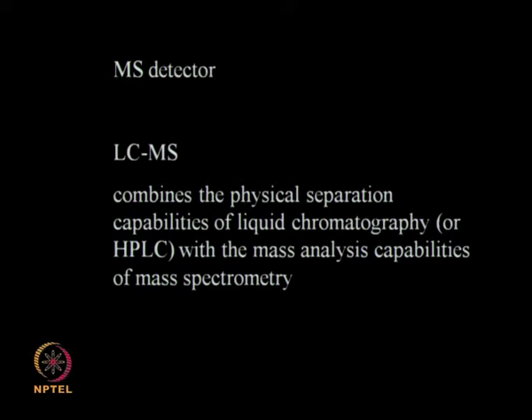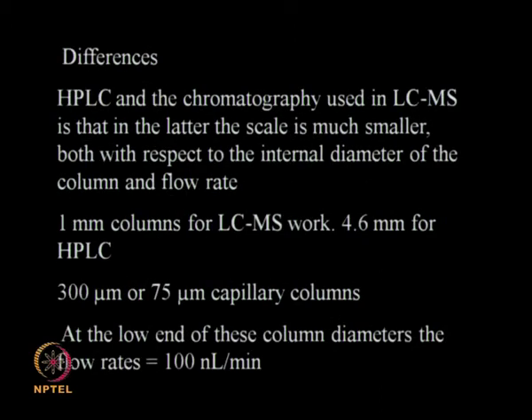If the molecule is a very small organic molecule, it is very easy to detect or imply. If it is a large biomolecule, then it takes quite a lot of time to understand the structure, but there are many databases available nowadays which give you the MS spectrum or MS fragmentation pattern, and then you try to imply what the molecule is.